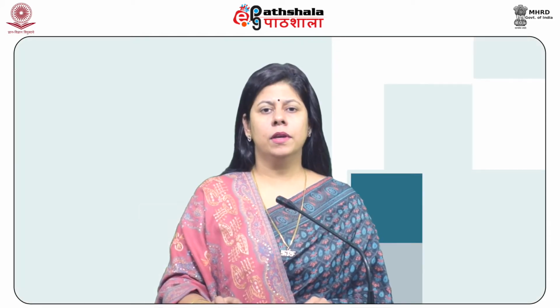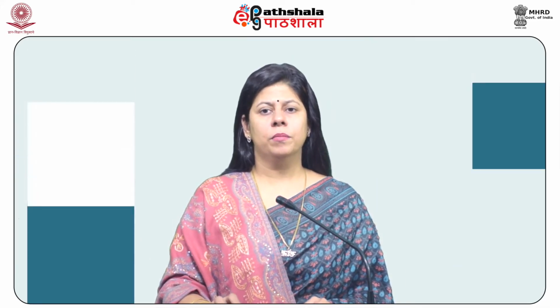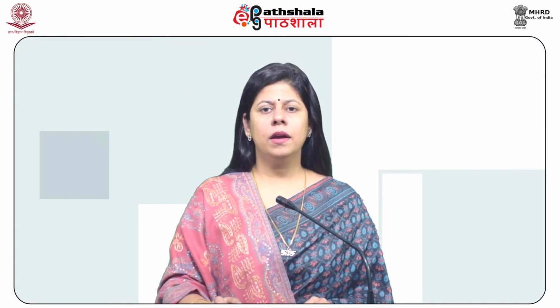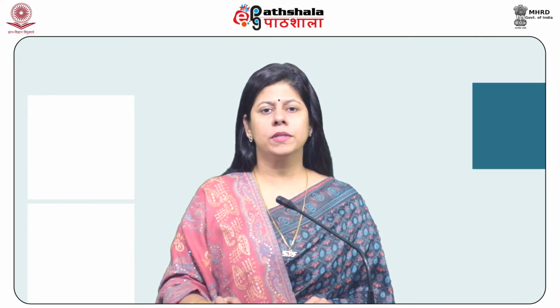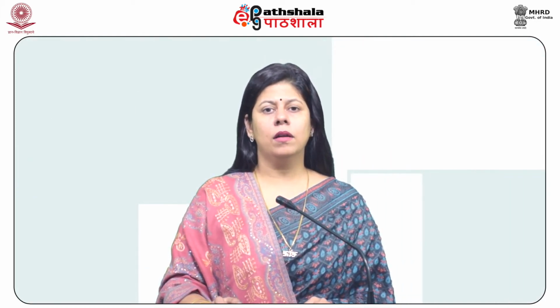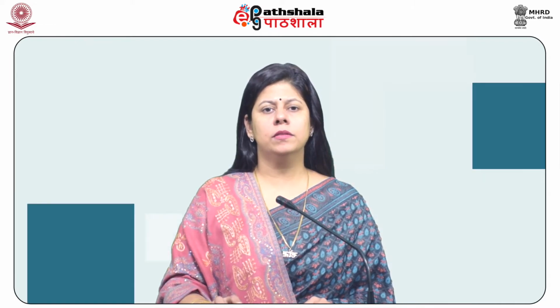Thicker sample layers compensate for these smaller molar absorptivities. Because the absorptivities are so low, the NIR beam penetrates deeper into a sample in reflectance techniques, giving a more representative analysis. Furthermore, minor impurities are less troublesome in both reflectance and transmission methods than in the mid-infrared region.